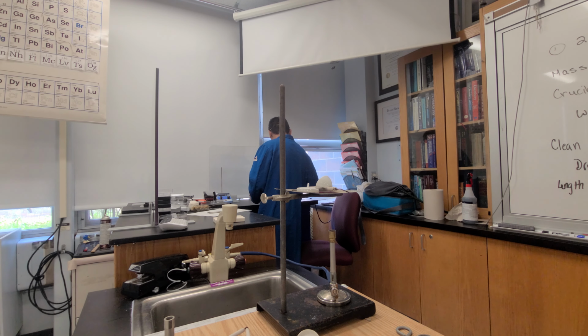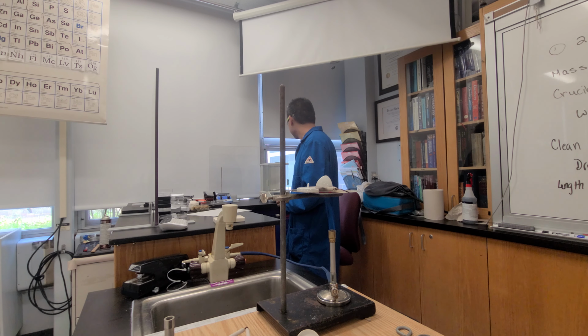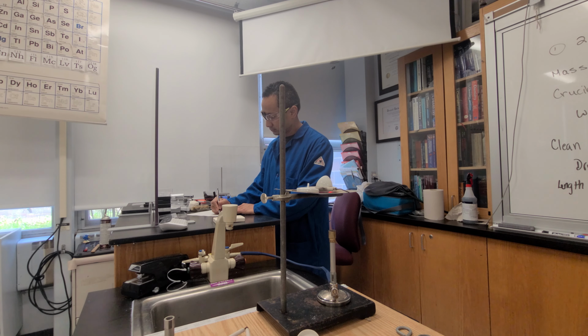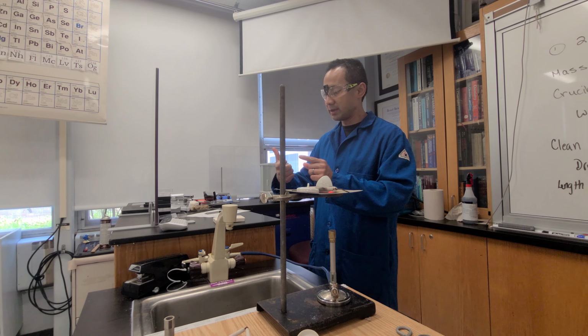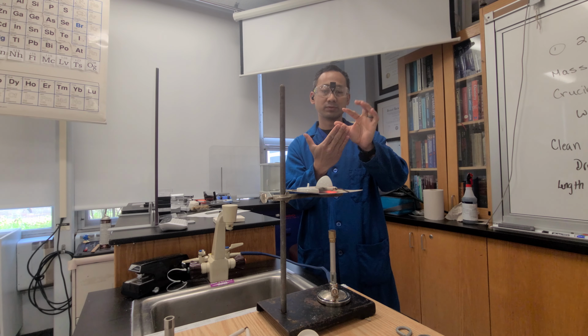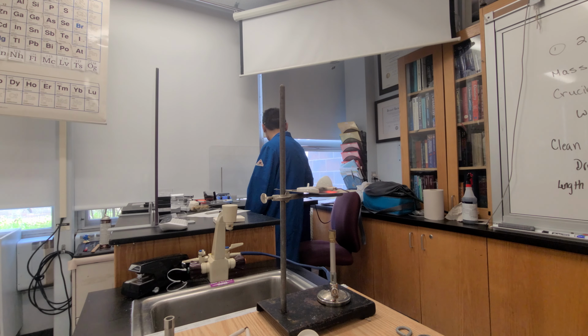So I'm going to weigh this out. Looks like it's 0.1910. Okay. And how I normally measure is I take my finger, unroll it, and I know that it needs to be the length from base, from thumb to tip here, right? So just slightly longer than my index. And that's going to get about 0.2.